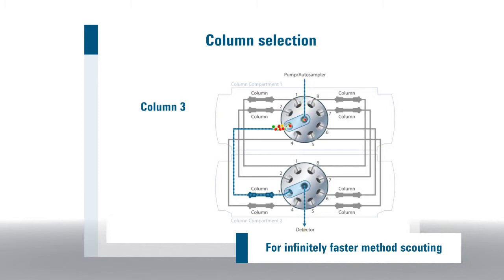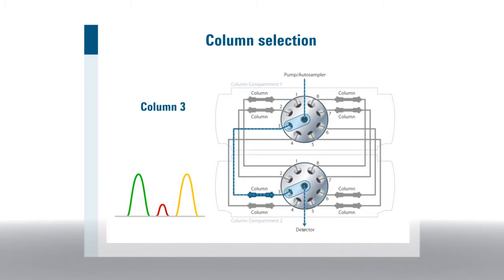Combination with further switching valves for solvent selection gives you a comprehensive solution for automated method development. Without the need to interact with the system, you have over 1,000 unique sets of separation conditions at your fingertips.